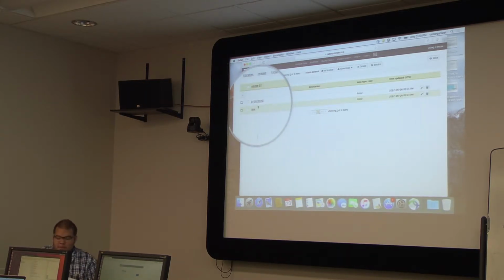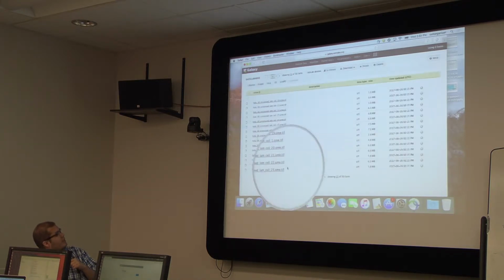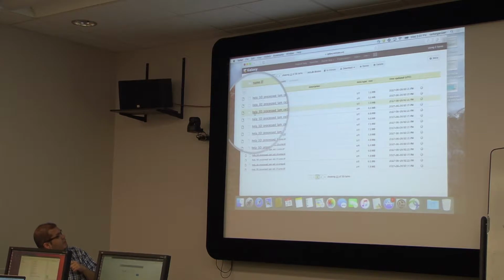So I talked about it this morning that to CellOrganizer you can either submit images that are raw, and then there's a specific pipeline that will try to clean them up, remove some noise, do some simple pre-processing. What I cheated for the purpose of this tutorial, and I cleaned them up beforehand, so computation would be faster. So I'm going to click Process, and I'm going to see my list of images here.